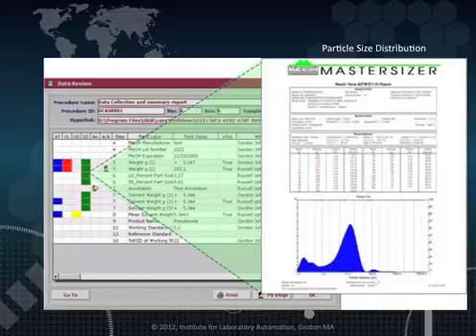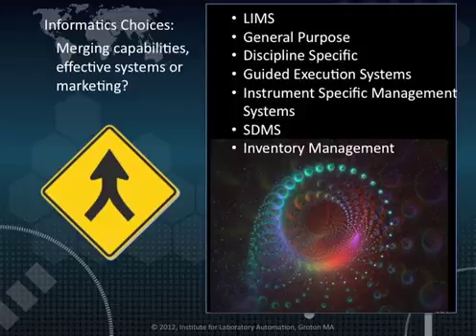However, there are some limitations. For example, the information on the chart on the bottom of the page is limited in quality to that produced by the instrument print output. You can't zoom in and look for more detail.